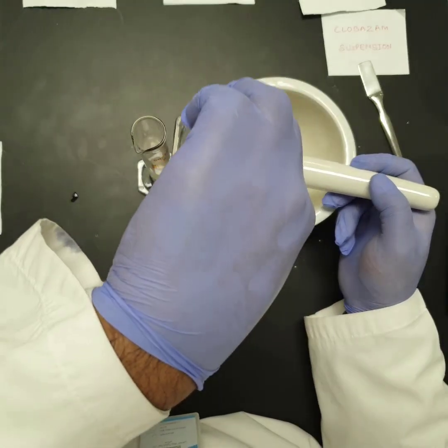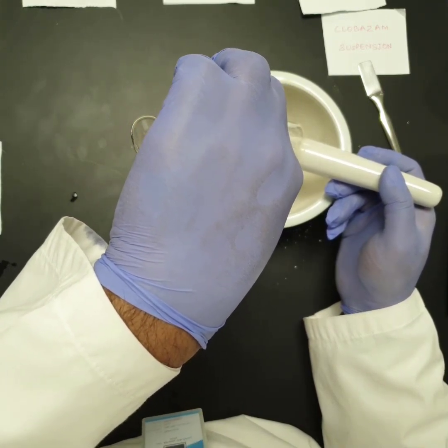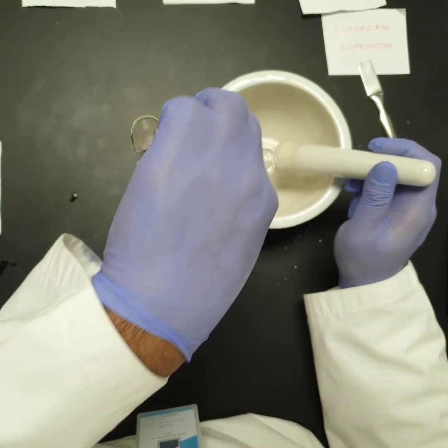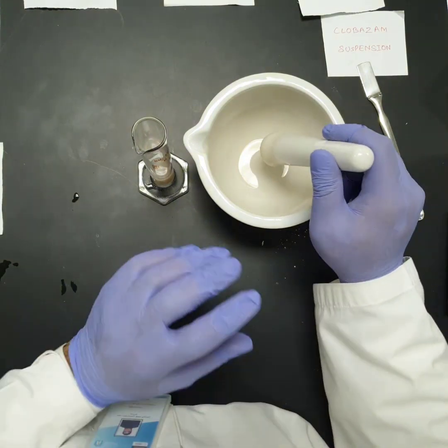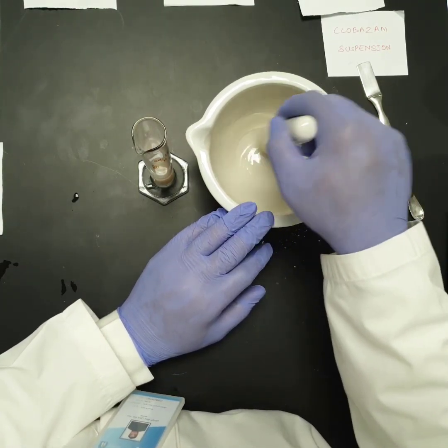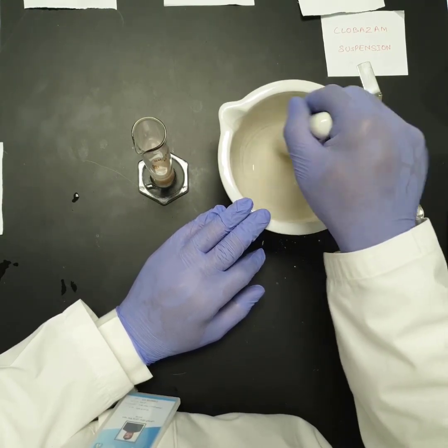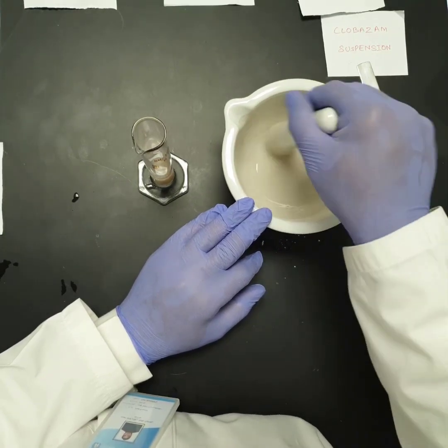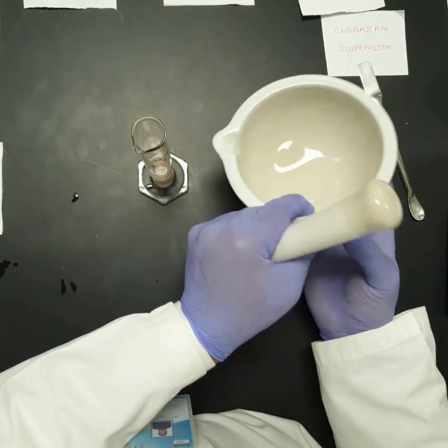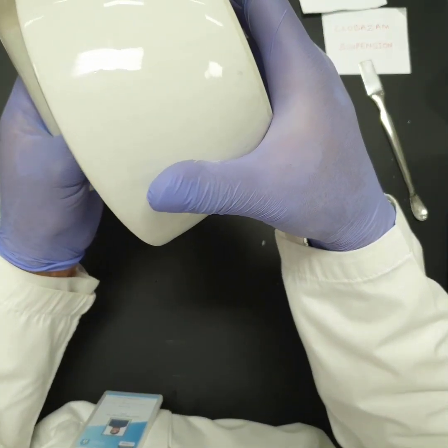As you can see, syrup is a thick substance. So sometimes we have to overturn the graduated cylinder for a longer time so that all the syrup will come out of the graduated cylinder. Now by this I have added all the graduated cylinder syrup into the porcelain mortar. Now I am going to wash this. As you can see, I have washed the porcelain mortar and I am adding the rinsing back to the graduated cylinder, the final graduated cylinder.